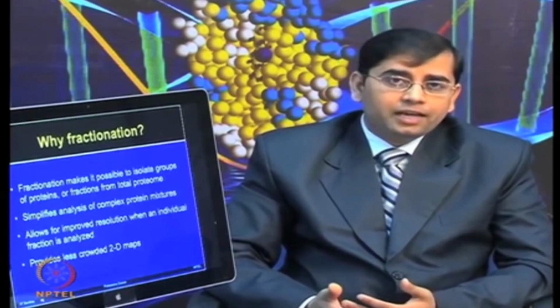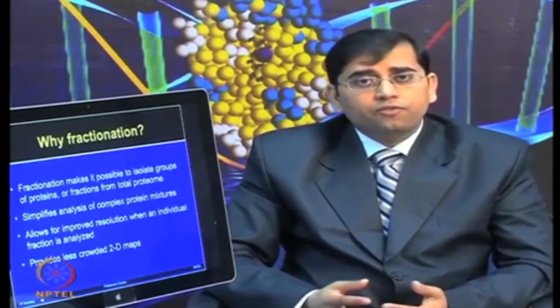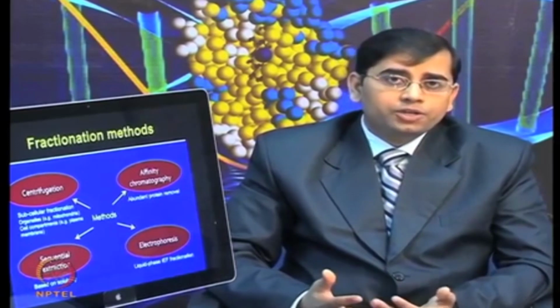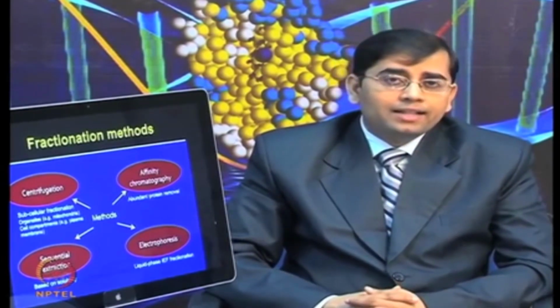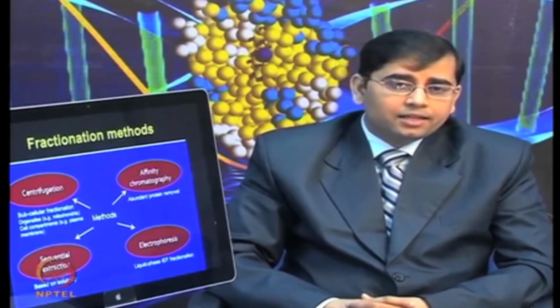So, again fractionation can serve a good need in both gel based and gel free proteomic applications. So, let us talk about different types of fractionation methods available. Simplest for looking for the organelle or a specific type of proteome, people use different ways of centrifugation, ultracentrifugation, when you are looking for subcellular fractionation of organelles such as mitochondria or chloroplast or cell compartments such as plasma membrane.